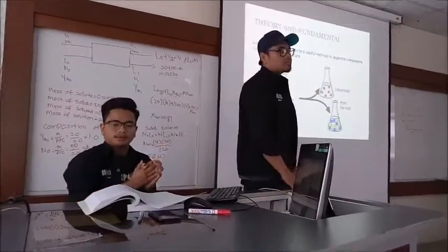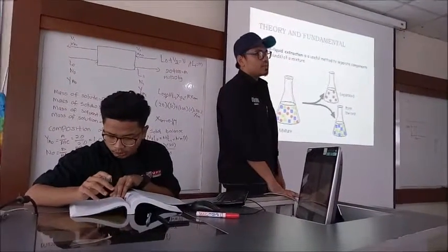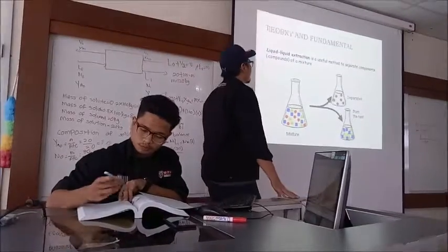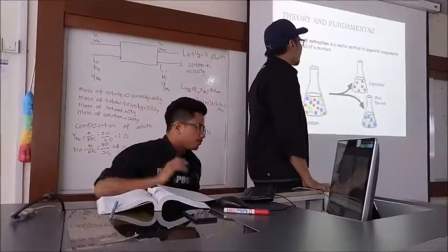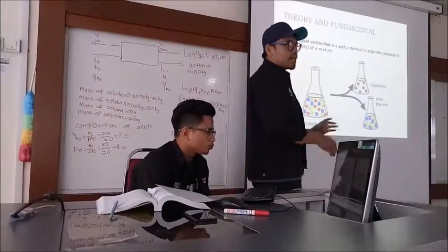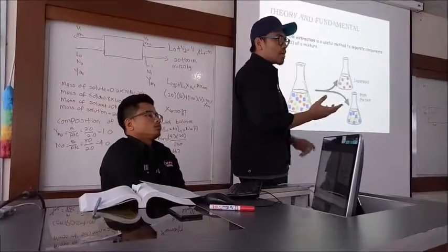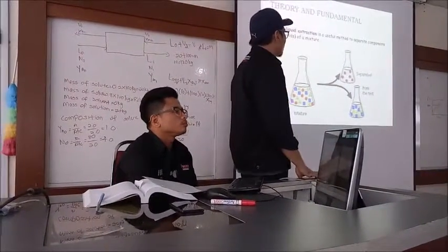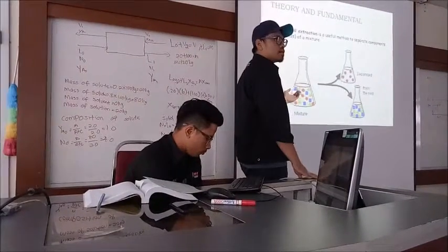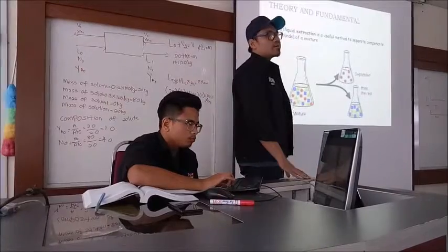Before we start, I would like to explain more about the fundamental theory for this topic. Basically, liquid and liquid extraction is a useful method to separate components of a mixture. In simple words, liquid and liquid extraction, also known as solvent extraction, is used to separate the desired compound from a mixture by using two types of stream.